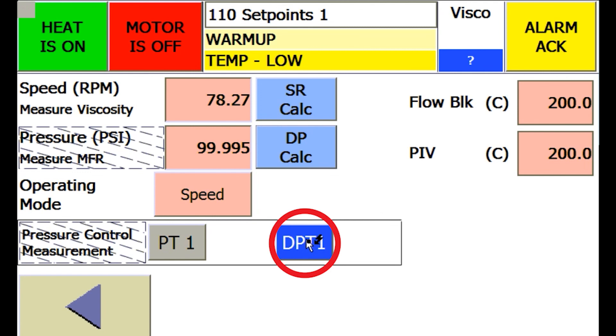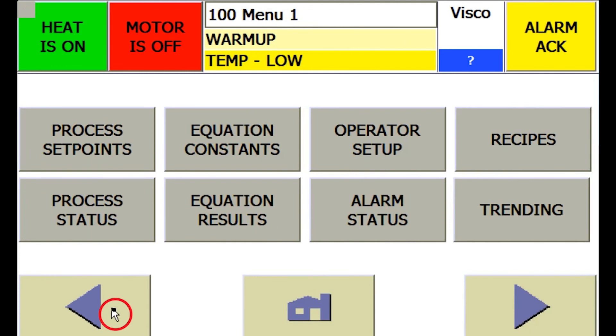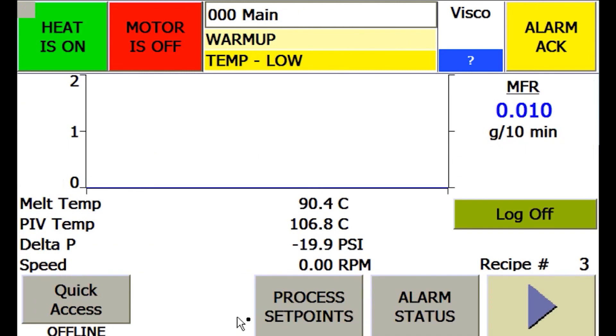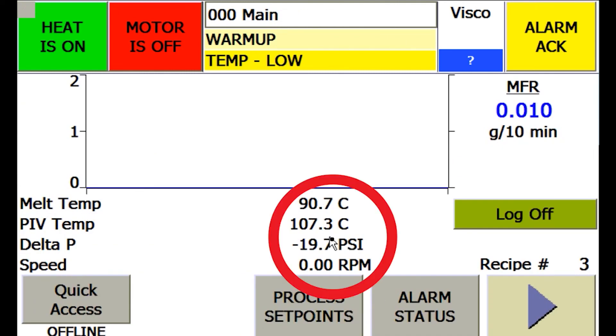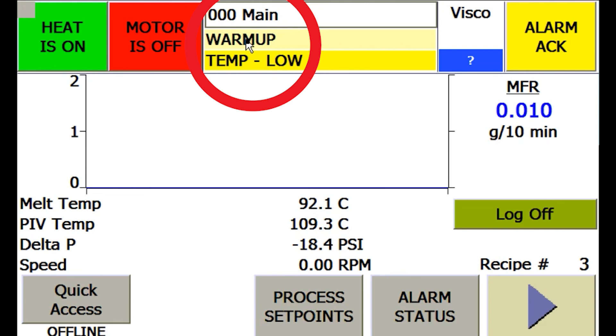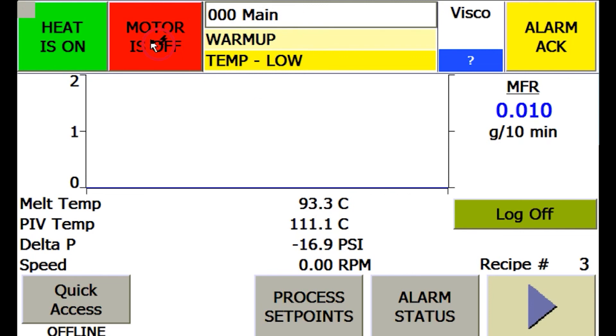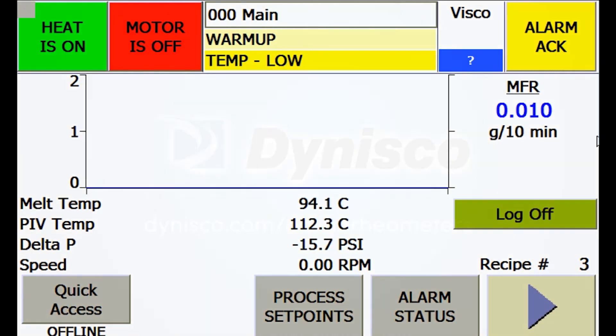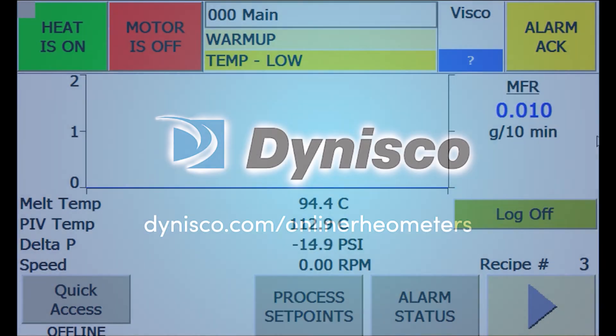Pressing the back arrow button twice from this screen will return you back to the main screen. As you can see here, the system is heating up. Once heated up to the 200-degree set points entered, then the warm-up state will change to ready and the motor can be started and the system will run to the control point we have just set.